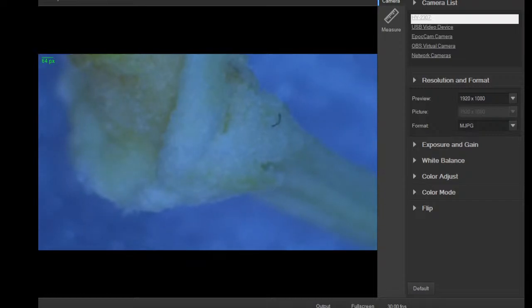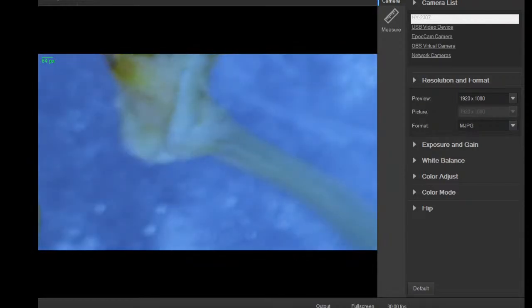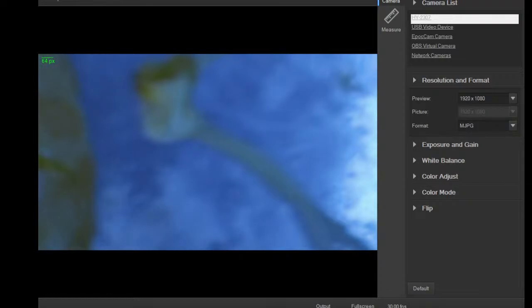So if you show this to somebody, not tell them what it is, they think, oh, that thing's covered with fungus. It's growing a horrible fungus on it. Throw it away. And then you zoom out and you go, oh, it's from a Mandarin orange. So, just like with everything else, context is very important. Wish politics worked that way, but oh well, it's another matter.